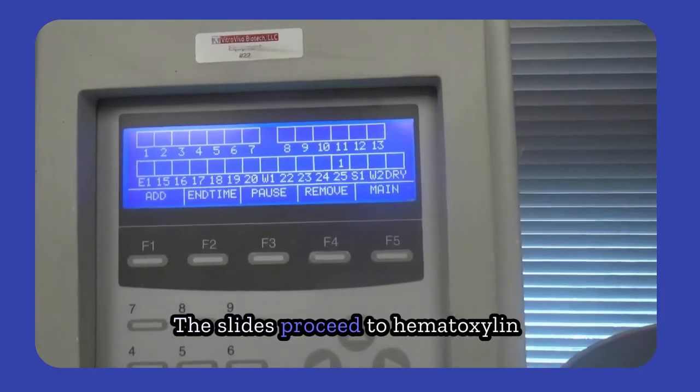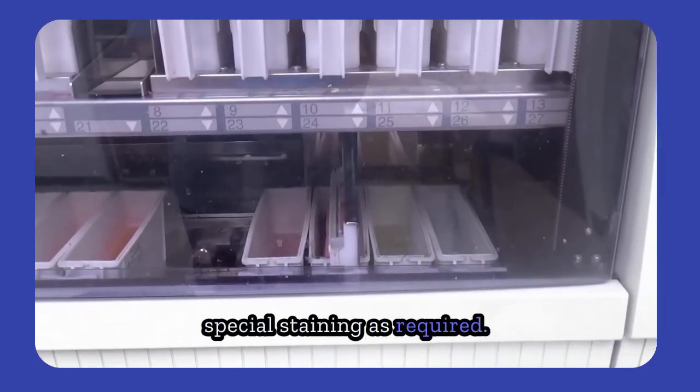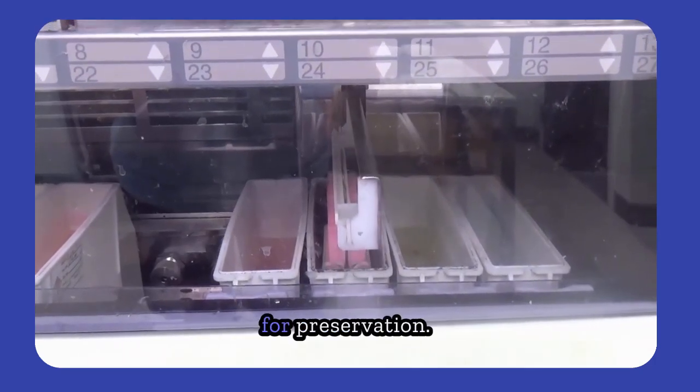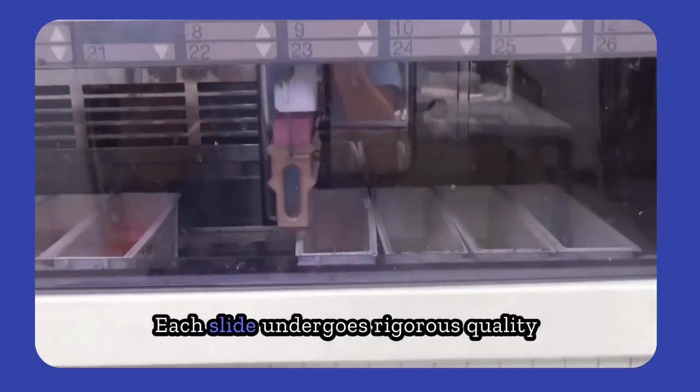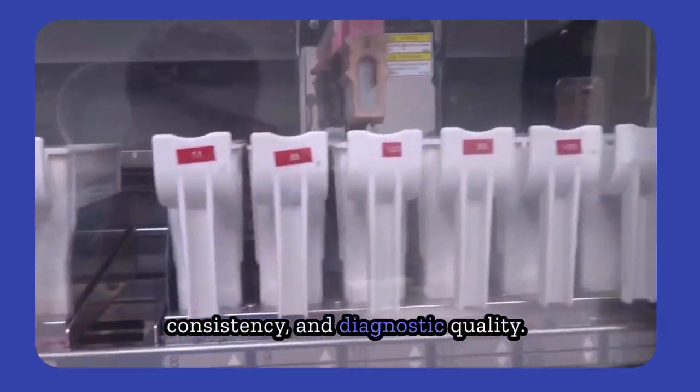The slides proceed to hematoxylin and eosin staining, or other special staining as required. After staining, slides are dehydrated, cleared, and coverslipped for preservation. Each slide undergoes rigorous quality control to ensure clarity, consistency, and diagnostic quality.